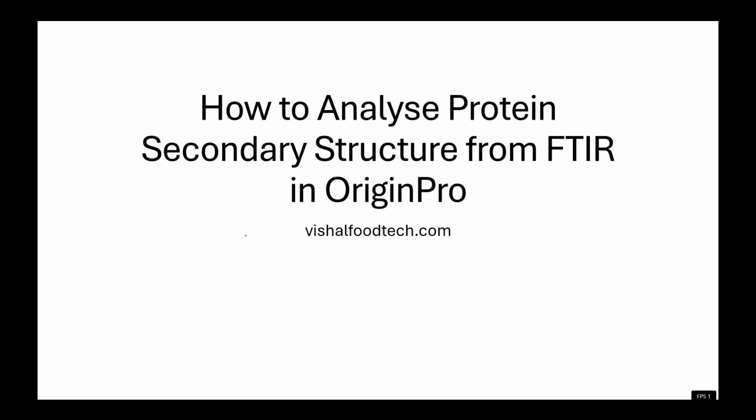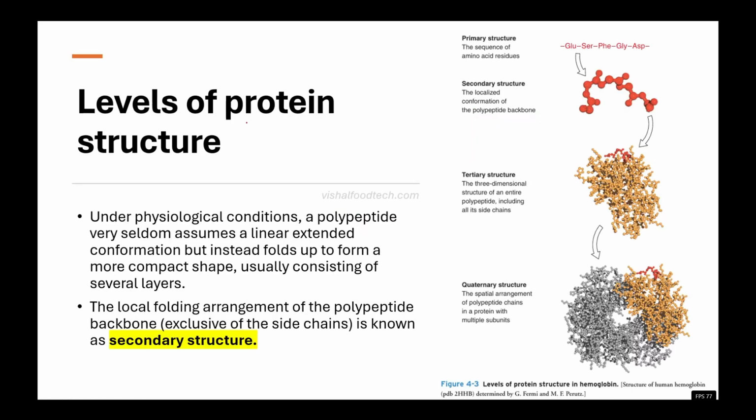Hello everyone. Today we will see how to analyze the protein secondary structure from FTIR data in OriginPro software. So first of all, we will see the levels of protein structure.